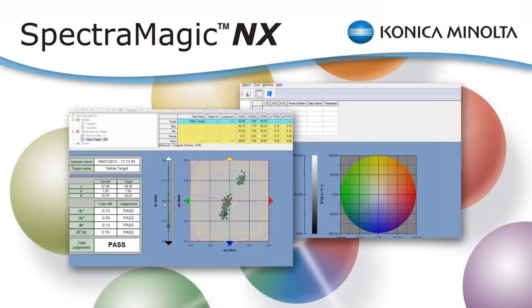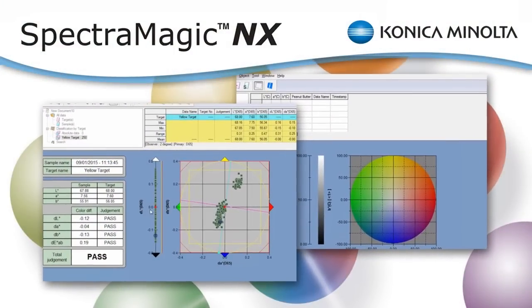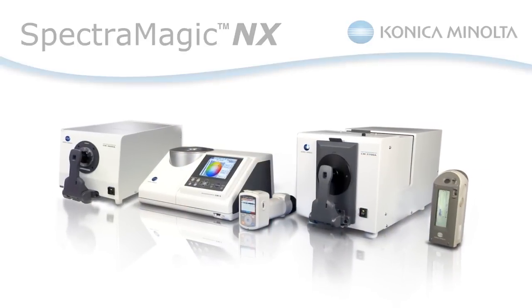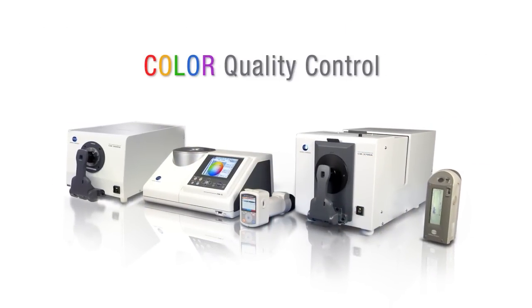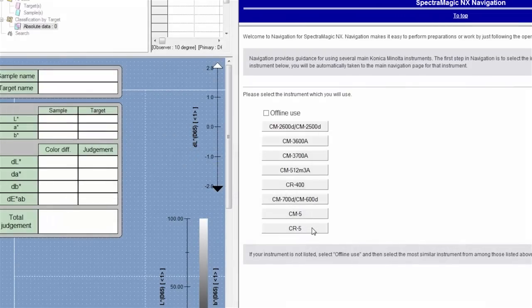Konica Minolta Sensing's SpectraMagic NX software is a complete quality control solution for the measurement and analysis of color. Use this powerful software with Konica Minolta Sensing's spectrophotometers and most colorimeters.